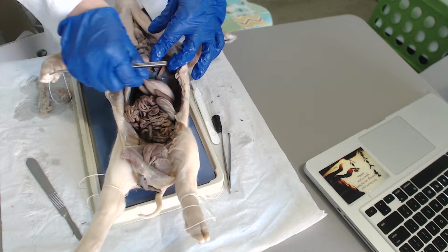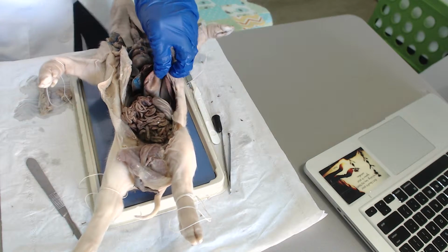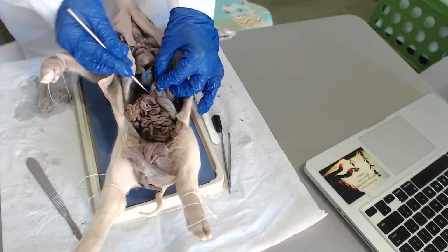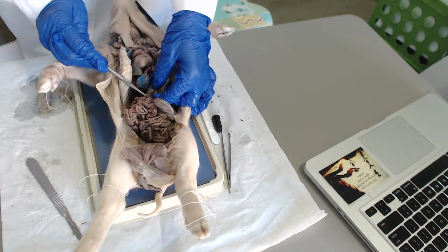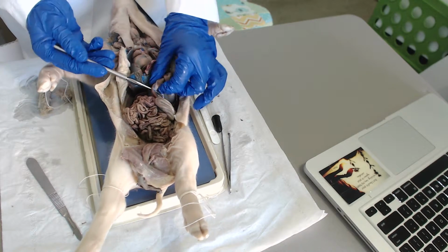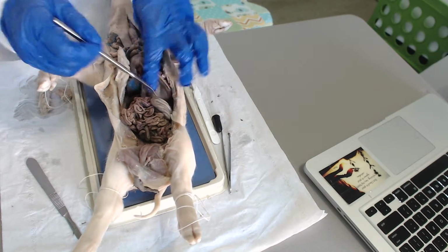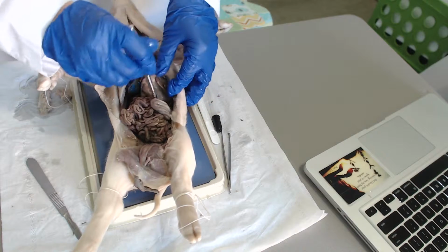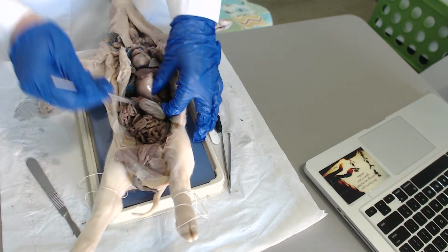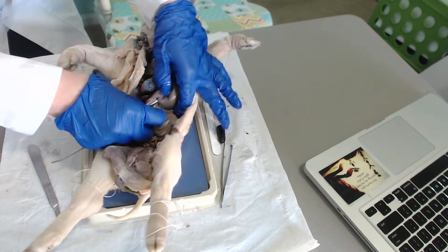this is the stomach. Okay, now once you pass the stomach, if you follow the end of it, you're going to find the duodenum, which is the portion right past the stomach entering into the small intestine. So you have the duodenum, and while you're in that area, you're going to find the pancreas.